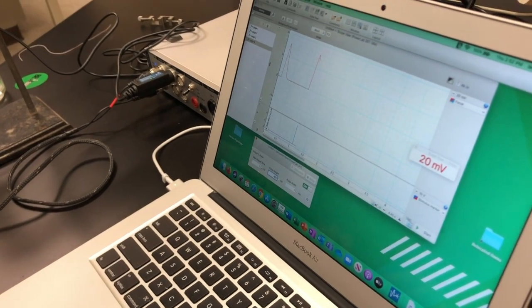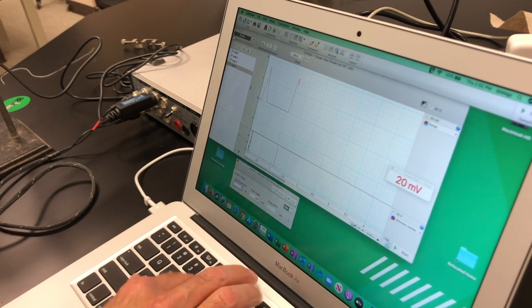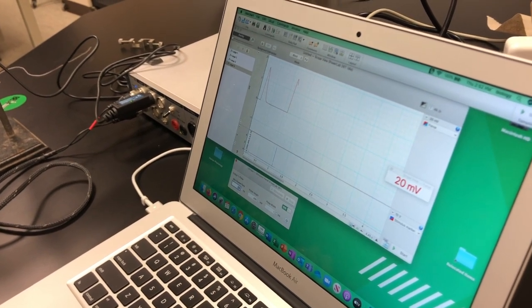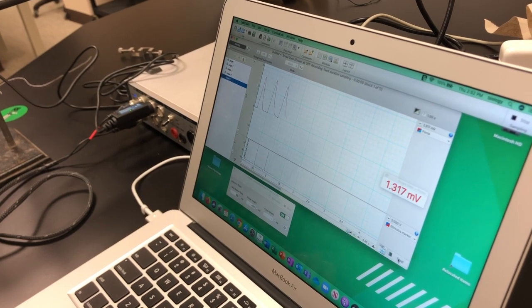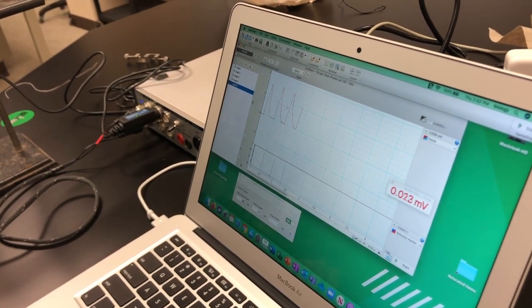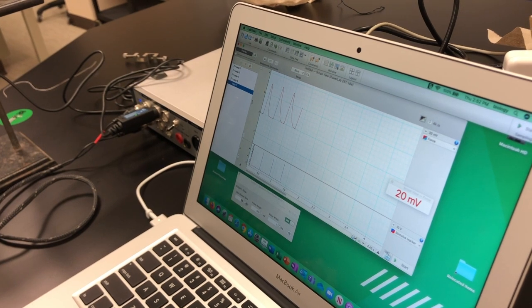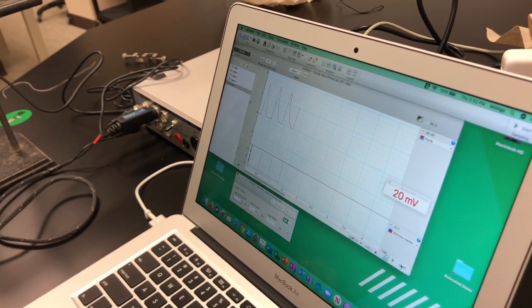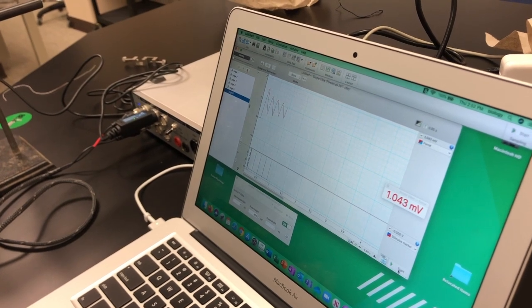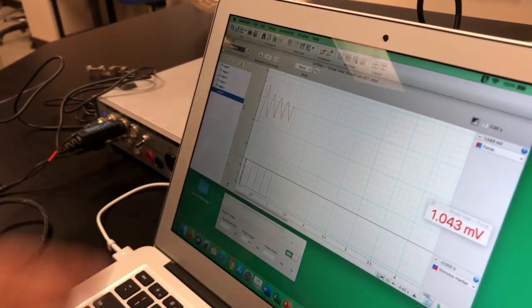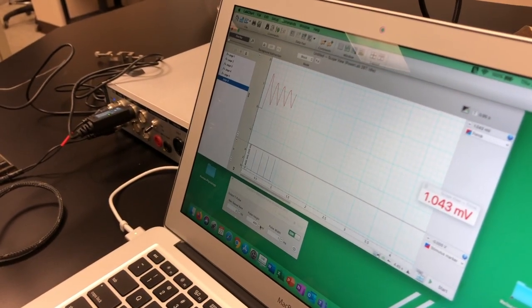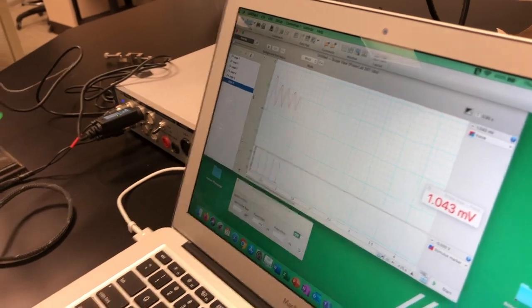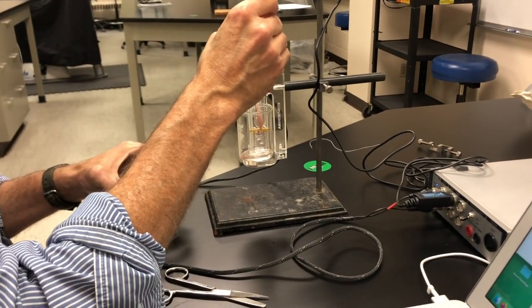Now let's go back down to say 400. And we increase the frequency say to 2.5. And we hit start. And you can see peaks roughly about the same size. Now here you can see that the muscle doesn't have time to come back to rest.